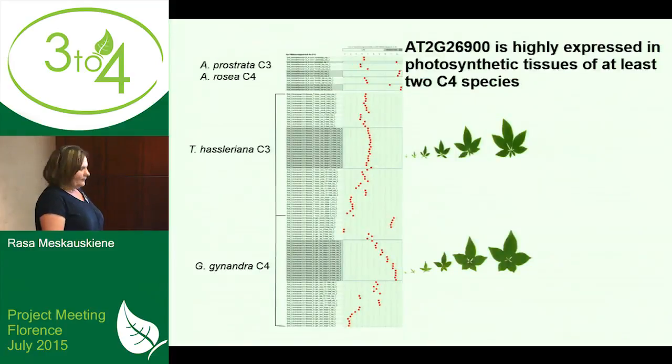So that's now the result from the samples tool. So here you have each sample of that experiment. All those belong to the C3 plant and all those to the C4 plant. And a dot is here now an expression value. So if it's more here, then it's low expression. If it's more at the right side, then it's becoming highly expressed.